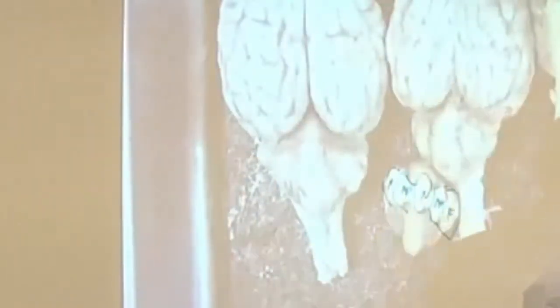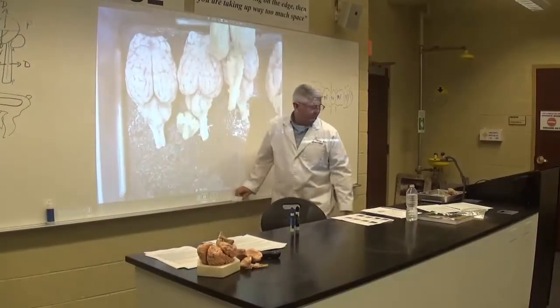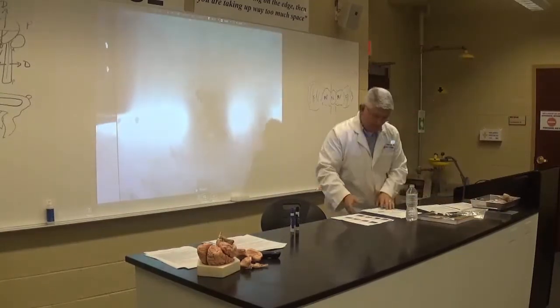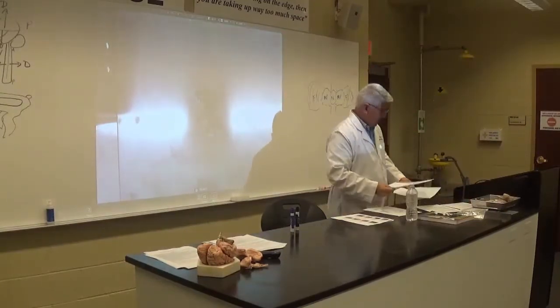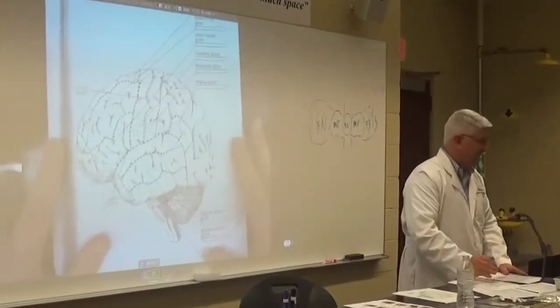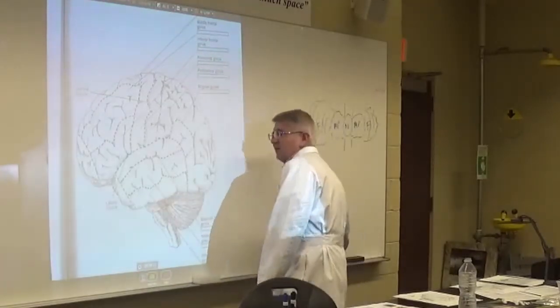All right. Last thing I want to show you before we get started are human brain specific ones. This is 7-3, okay?